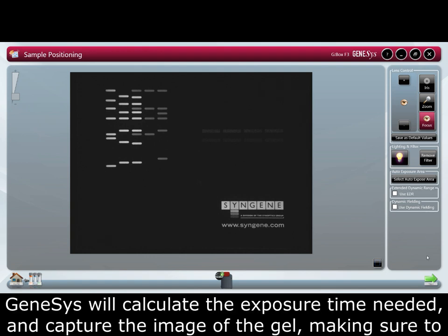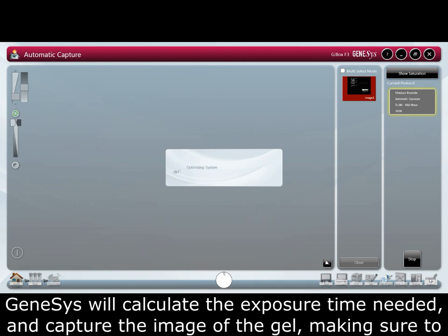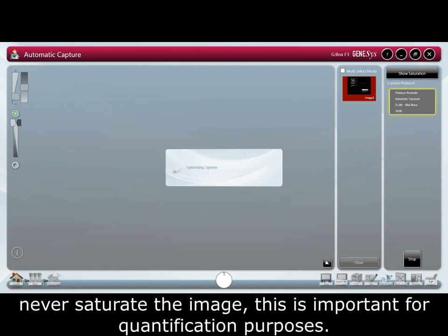Genesis will then calculate the exposure time needed and capture an image of the gel, making sure to never saturate the image. This is important for quantification purposes.